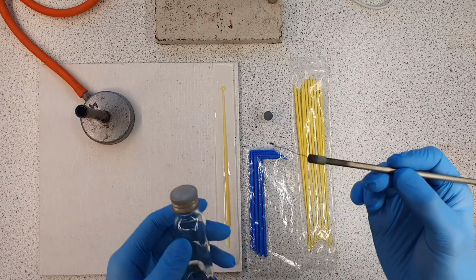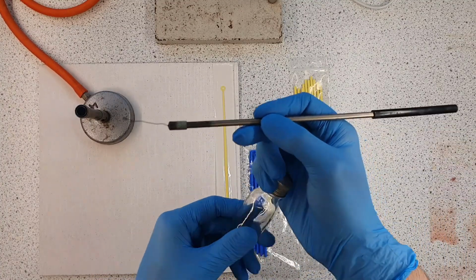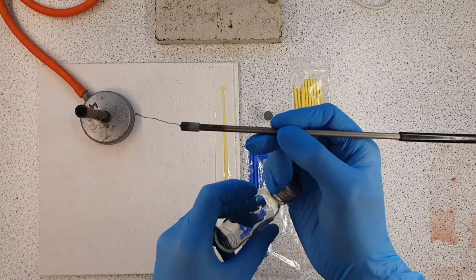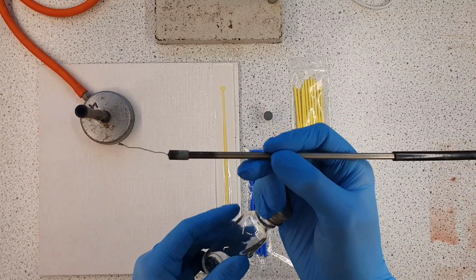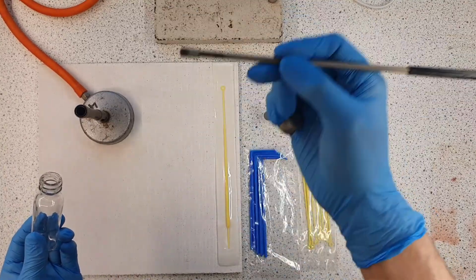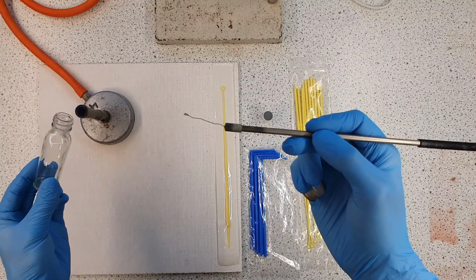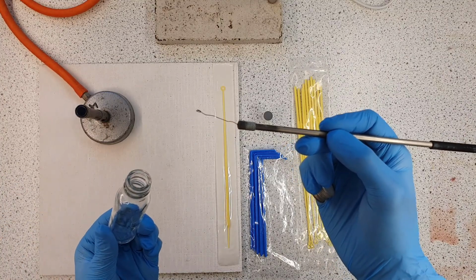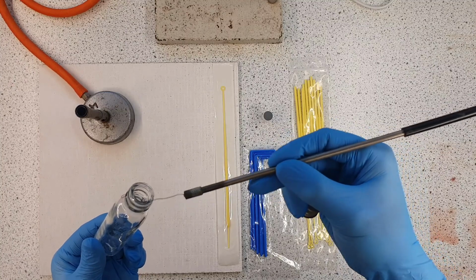Obviously if they're plastic, don't put it in a fire, that's common sense. But every time we either open or close a glass bottle in particular, we are going to be utilising our Bunsen burner to flame it, and I'll just demonstrate here. We've got our bottle, we've opened it, it's now potentially open to being contaminated by floating particulates. So we're going to hold it gently, rotate it slowly in the flame, not too long, don't need to burn anything. That has now killed anything that may have settled on the neck and interior.